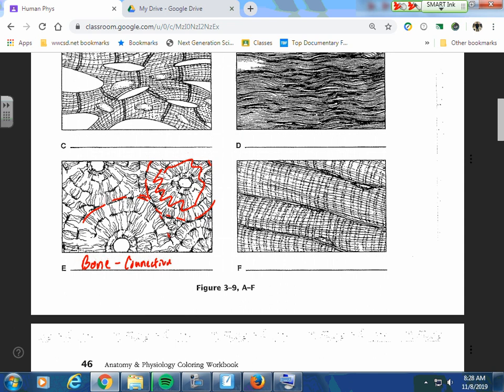Okay. This looks like another muscle. It looks striped. So muscle tissue. If it's striped, striated, that's what we call it. It can only be one of two types. It could either be cardiac muscle or it could be skeletal muscle. We already used cardiac, and the main difference is you can see up here, cardiac, all that branching, whereas with skeletal muscle, we will not. This is skeletal. Cool with that?